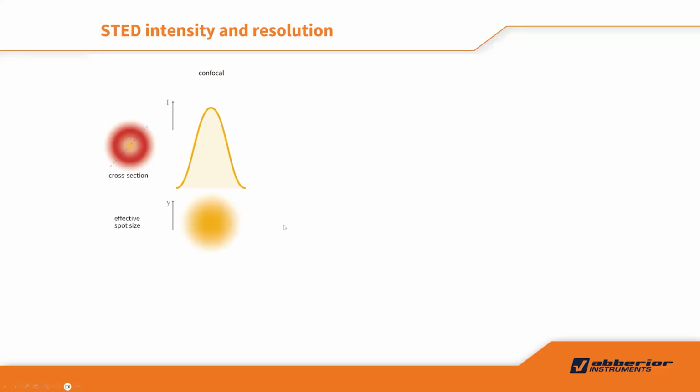Then we have the STED donut beam deployed and overlapped to the Gaussian excitation beam. And if you draw a cross-section, the line profile, you see the energy distribution of the STED donut, shown in this red curve. It overlaps the green curve at the back, which is a normal confocal excitation Gaussian beam. In the overlap area, there's STED effect. Therefore, on the detector, it's dark.